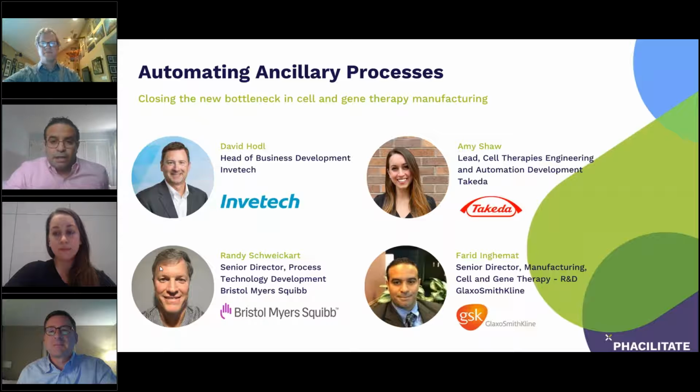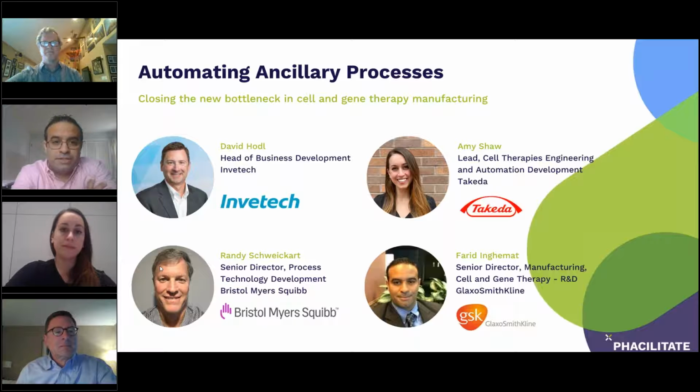Yeah, so again, the challenges are really finding off-the-shelf supplies that we can use directly without having to aliquot under a BSC, or find some kind of closed system to make that work. The industry is used to the volumes that the biopharm space sees, or perhaps even the blood industry to a certain extent, but is just getting their toe into the cell and gene therapy space, autologous specifically. I think allogeneic and AAVs, et cetera, are probably in a better place.